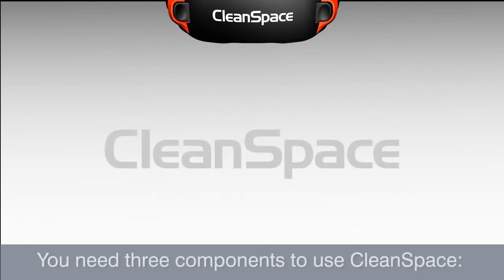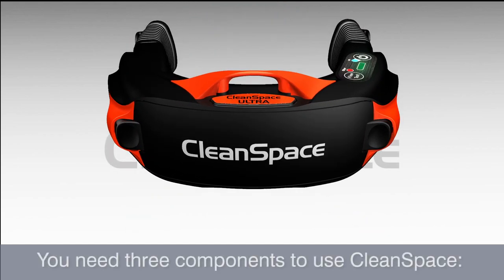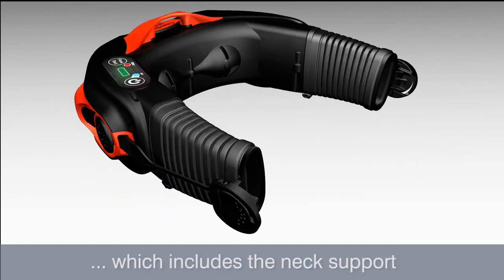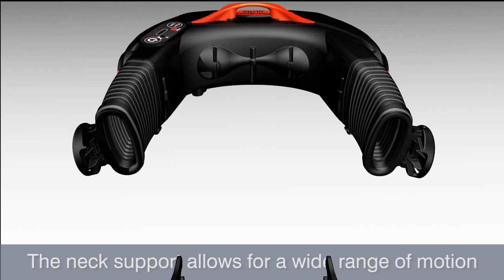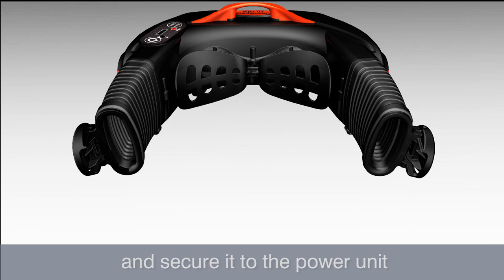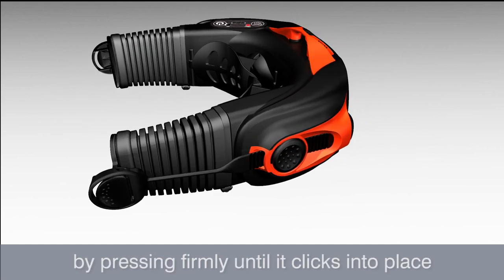You need three components to use a CleanSpace respirator. One: a power unit assembly which includes the neck support. The neck support allows for a wide range of motion. Choose either a small or medium neck support and secure it to the power unit by pressing firmly until it clicks into place.